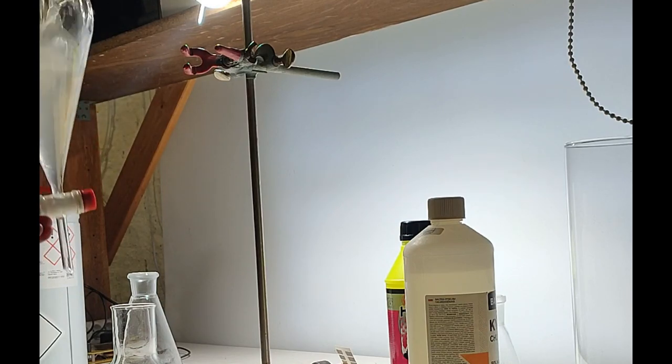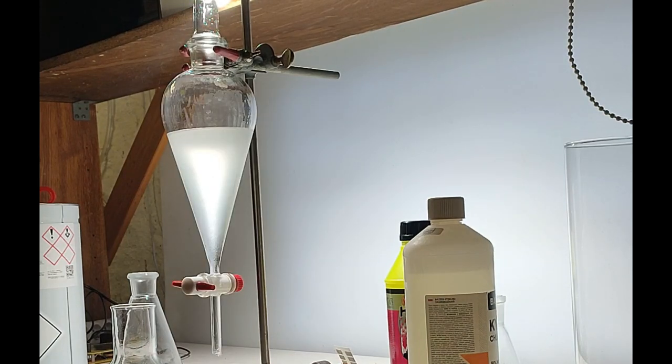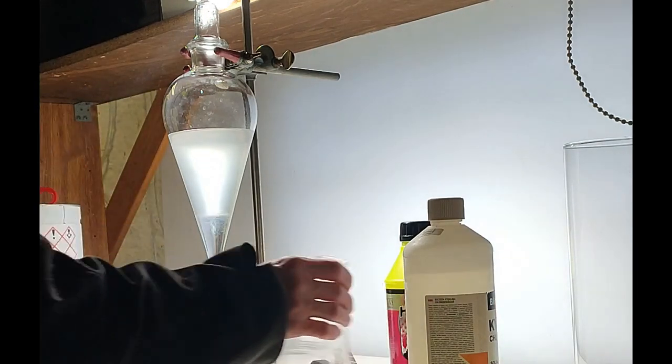Again, it's cold here, but I think they will be done after one extraction. I have no patience, and some methacrylate impurities won't be any problematic for me, even though, yeah, maybe I'll do two extractions, but this is not working at all. This will take some time until I get layers. Well, it was like, what, 15 minutes? Anyway, I declare this to be junk.